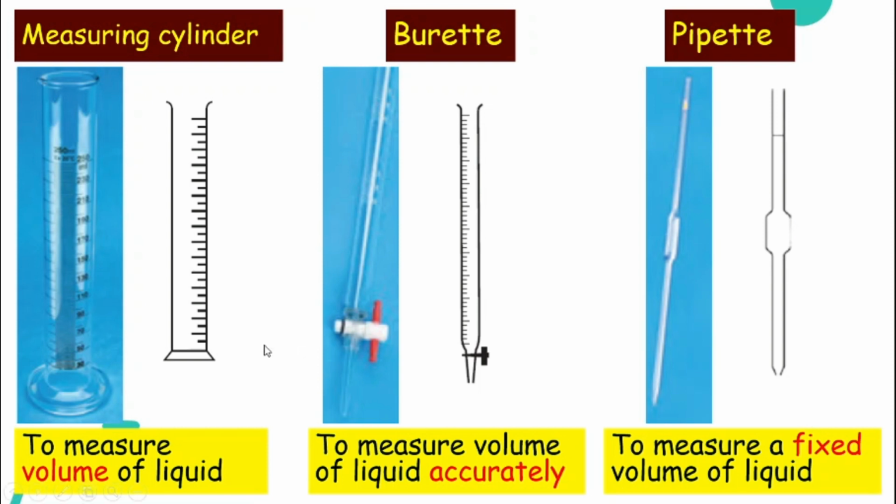So we have all these three. They have the same function, but you need to choose a suitable one for different experiments.